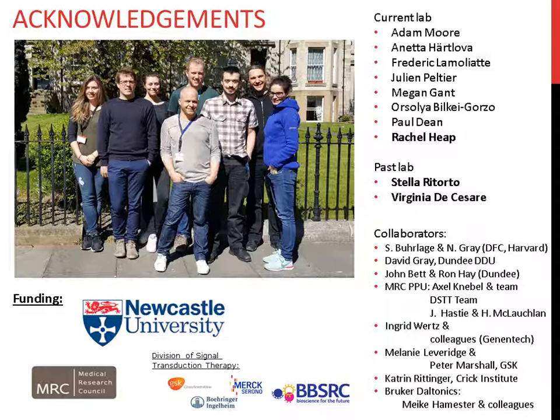There aren't that many matrices really around. Matrices usually come somewhere in the area of 400 to 800. The funny thing is, when I started using MALDI many, many years ago, it was always said this is an area where you just can't see anything. But actually, there are matrix ions, yet in many cases you can still see significant ions if your product and substrate are in pretty high concentration, which for MALDI they usually are, because it's such a sensitive technology. So we haven't seen much interference from any matrices, we must say.